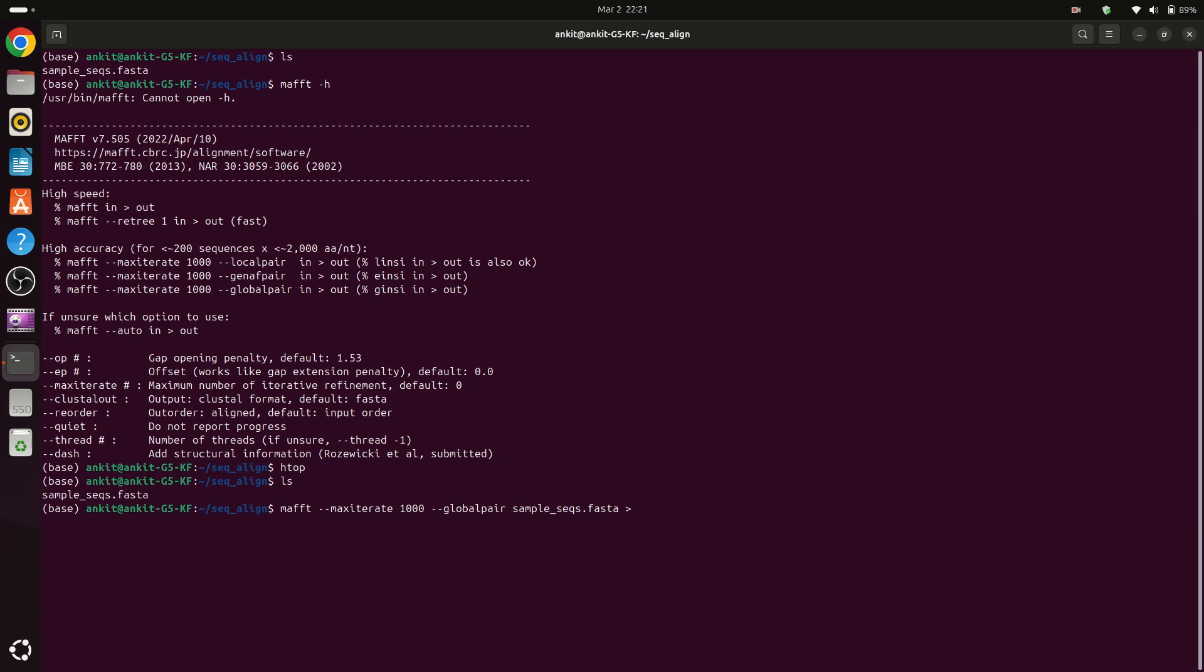For the output alignment file, so I am using the same name but I am adding here a suffix which is aln. Now for threads I can provide here 10 threads.